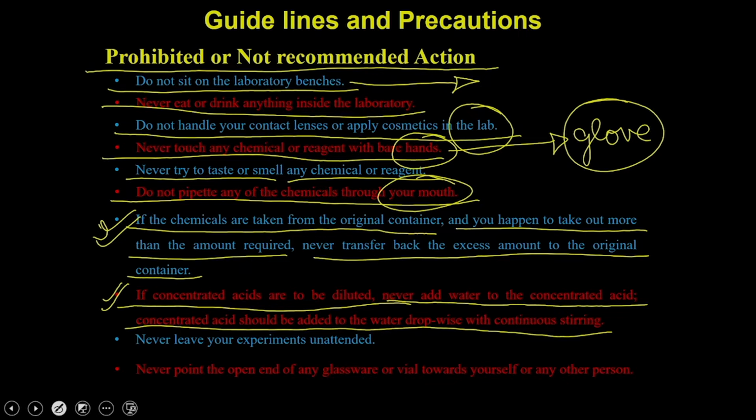Never add water into the strong acid, because that is the way you are going to create exothermic reactions, and that is not recommended. Instead, what you do is take the water and add the acid drop wise. The same is true for the base as well.